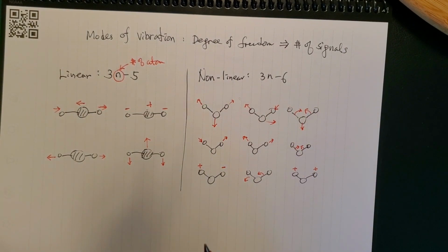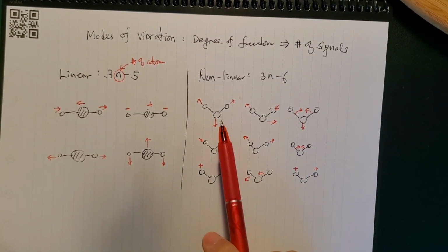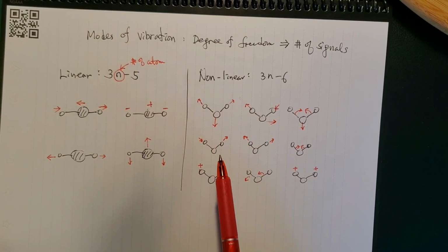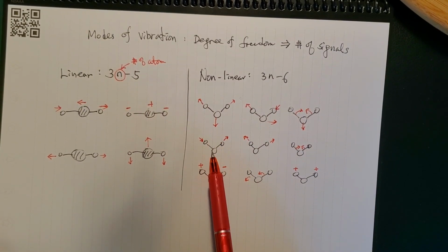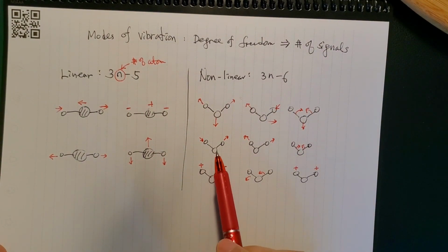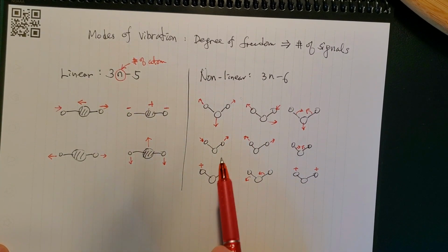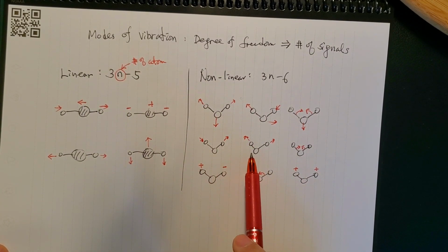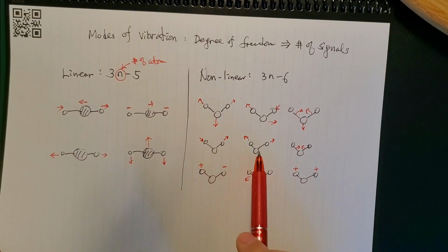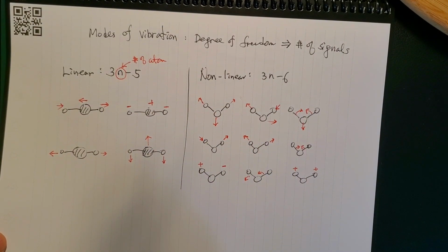Briefly, even for a functional group like CH2 or NH2, there are stretching vibrations, in particular asymmetric vibration and symmetric vibration. Though they refer to the same functional group, stretching vibration, they have different frequencies, and they will also have a different intensity due to the different amount of dipole moment caused by the vibration.